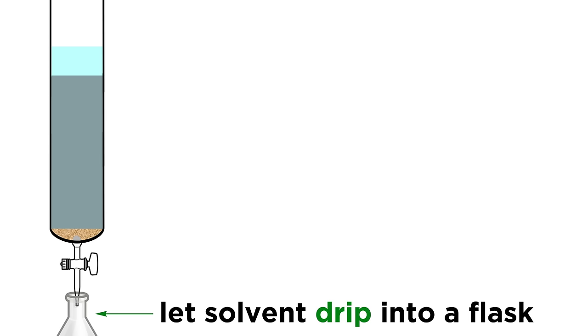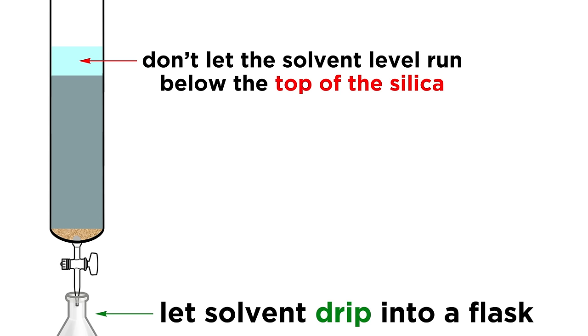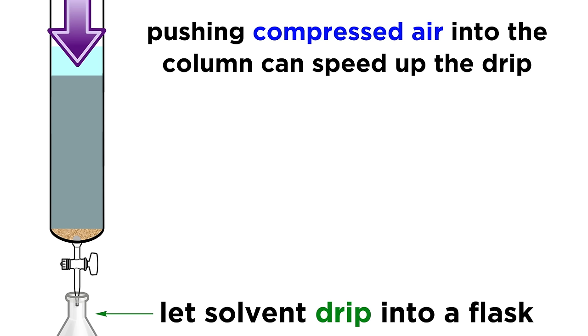Start letting the column drip into a flask to help the silica settle, but don't let the solvent level run below the top of the silica. Pushing compressed air through a tube fitted with a stopper at the top of the column can help things go faster during this stage, or any other stage during the separation if it seems necessary.